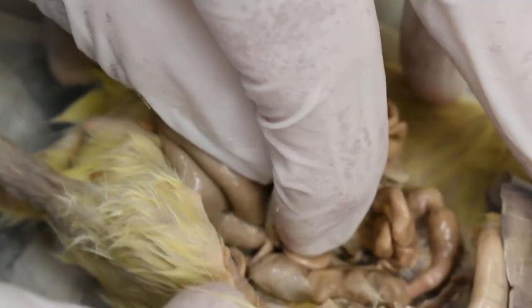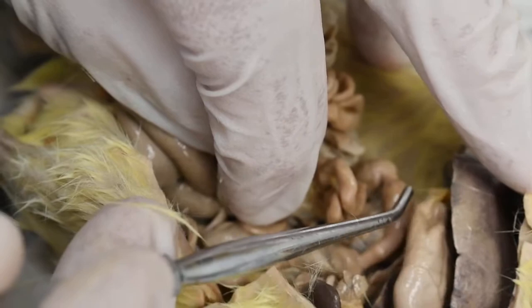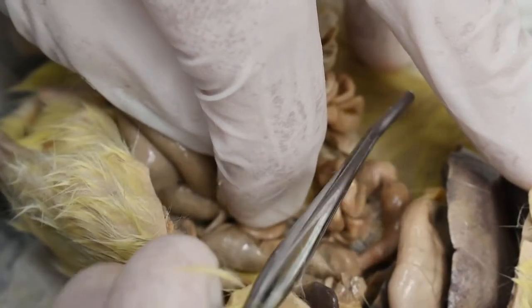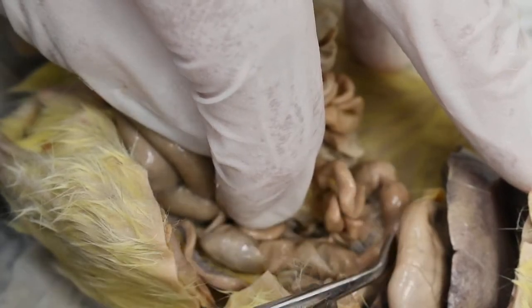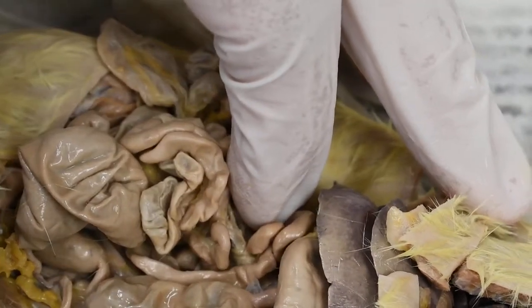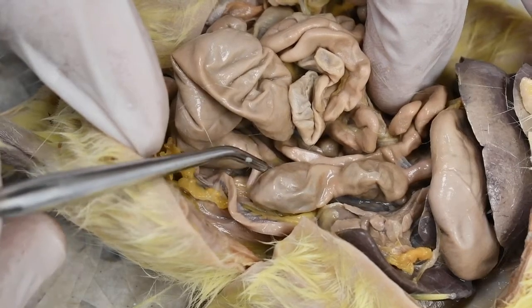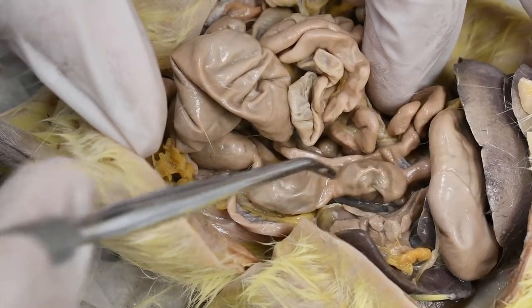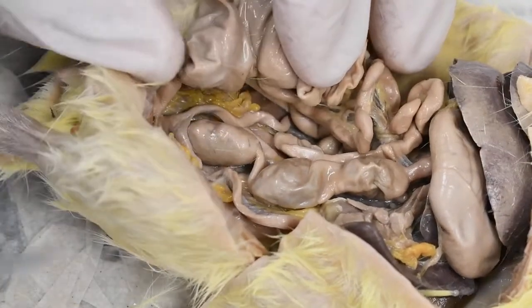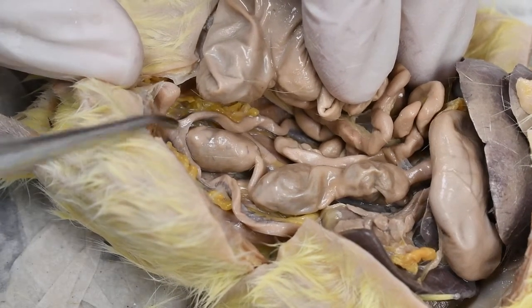So what's going on here is we have ascending colon on the left, then there's a transverse section. Transverse means perpendicular to the body axis. So that's the transverse colon, and then it starts going down, and that's the descending colon. All right, descending colon. As you can see, there's little rat pellets forming in there, so it's on the way out. So that's, at that point, it's going to connect to the anus, and then these rat pellets can be excreted that way.